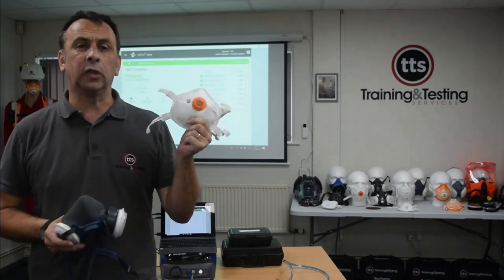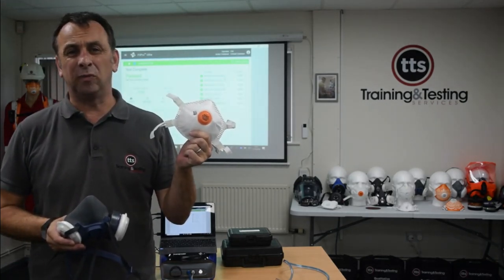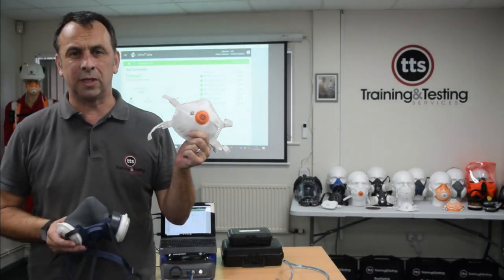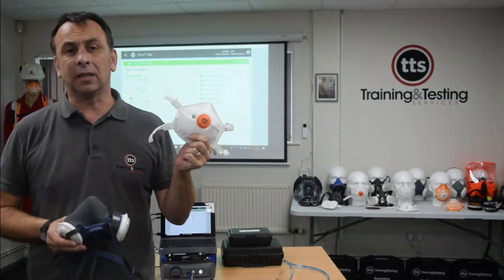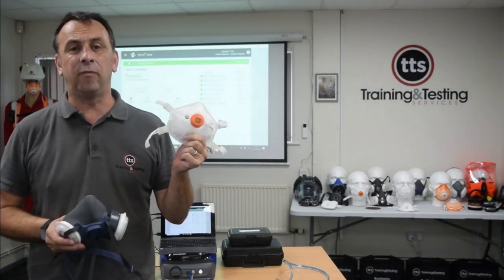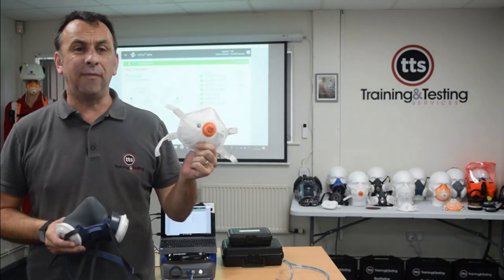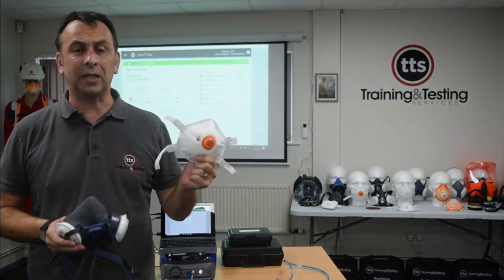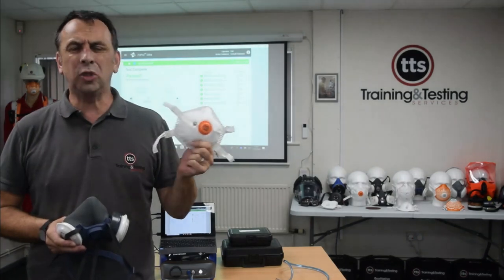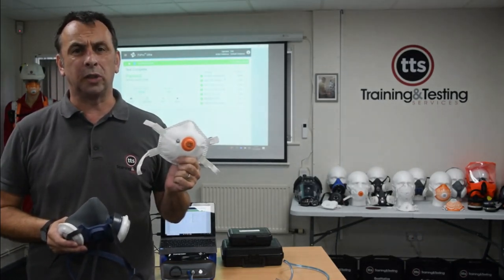So if we look at the Alpha Solway 3030V with 7 days worth of growth, it passed with an average fit factor of just over 700. It was about 775. When we repeated that same process, we basically ended up with over 3.5 times that level of protection by simply being clean shaven. So if we're not clean shaven, even if we are using a good quality mask, even though yes it'll pass, we're still reducing what this mask is capable of doing. Why would we want to do that to ourselves?